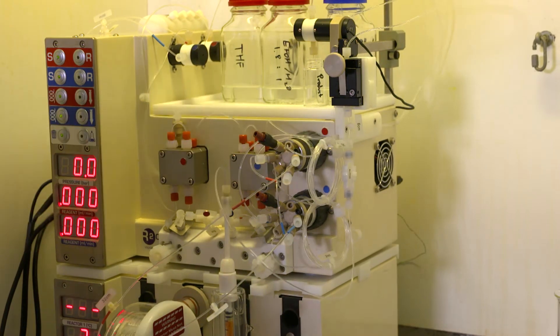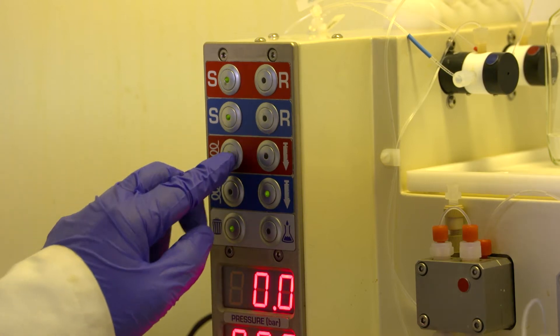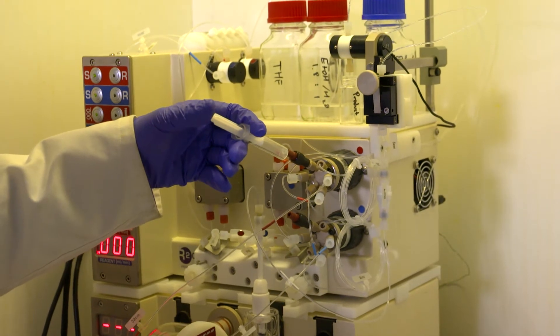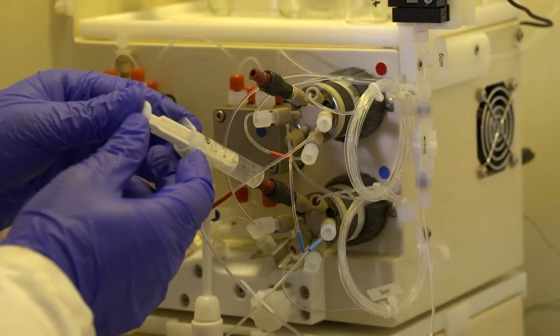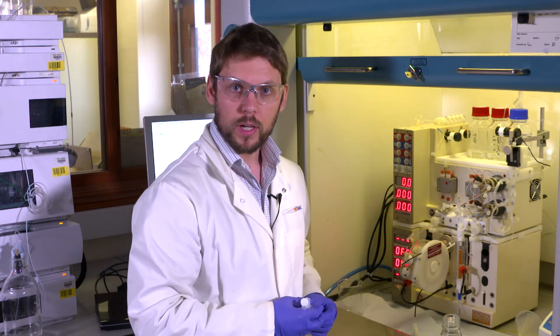I'm using sample loops today and this is how you load them. Before I load the loops I need to make sure that they are in the load position. I want to make sure that the loop is empty so I don't get mixing with anything else. To do that I'm going to use a syringe to push some air into the loop and displace anything that might be in there. I'm using two milliliter loops today. To load the loop I need to draw slightly more than that into a syringe and then I can manually inject into the loop now that I'm happy that it's empty.